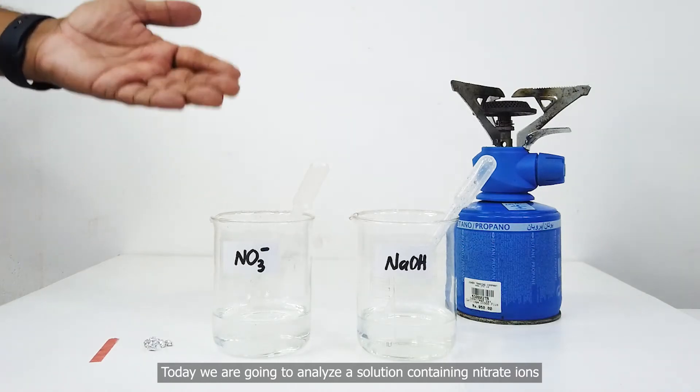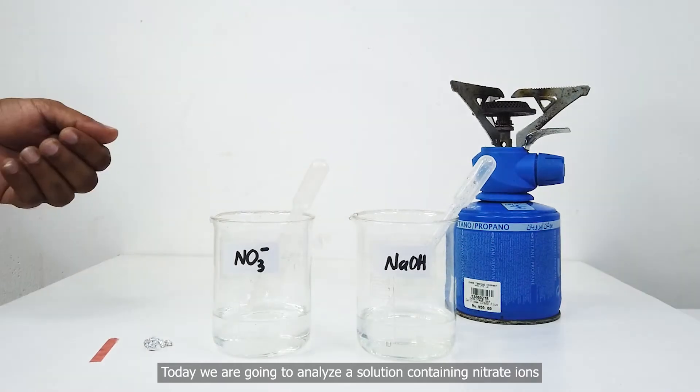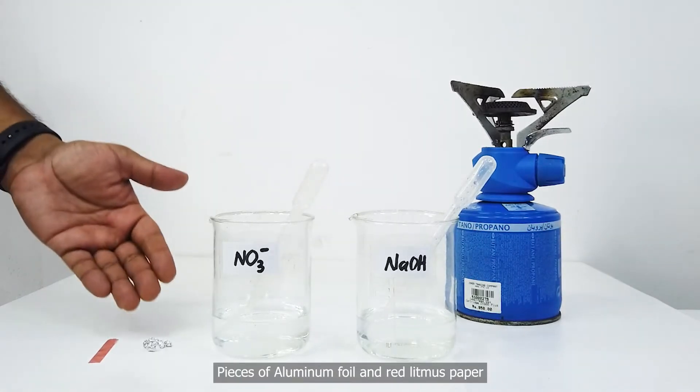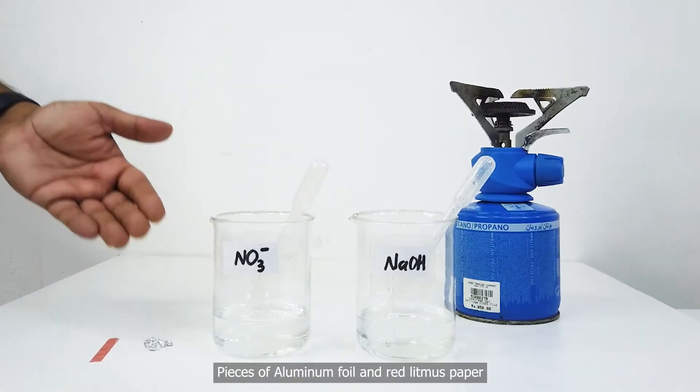Today, we are going to analyze a solution containing nitrate ions. We need sodium hydroxide, pieces of aluminum foil, and red litmus paper.